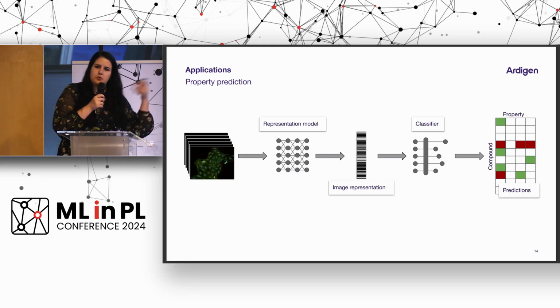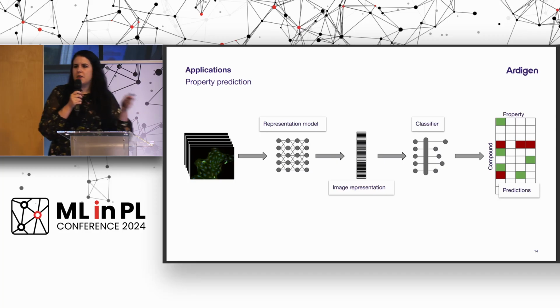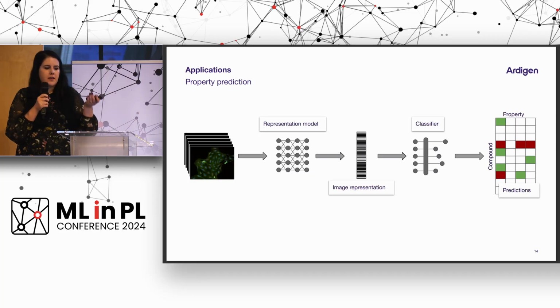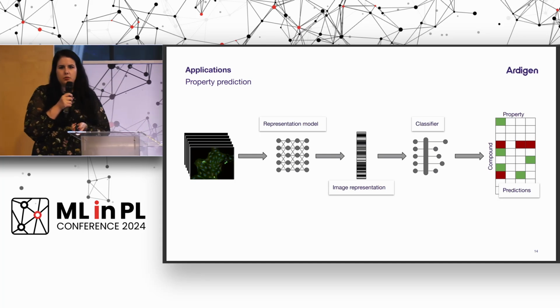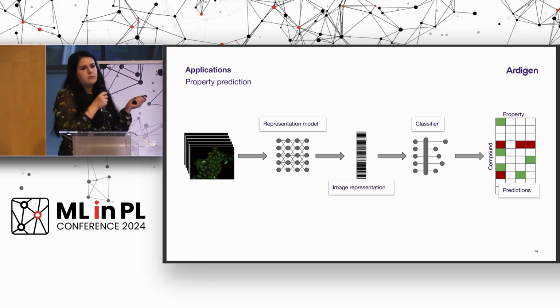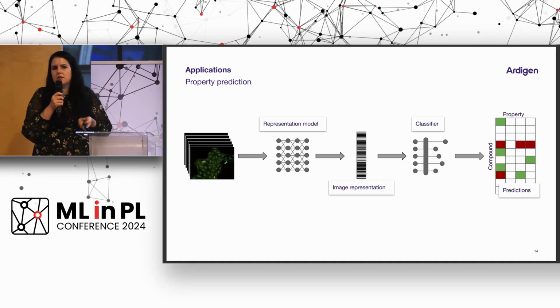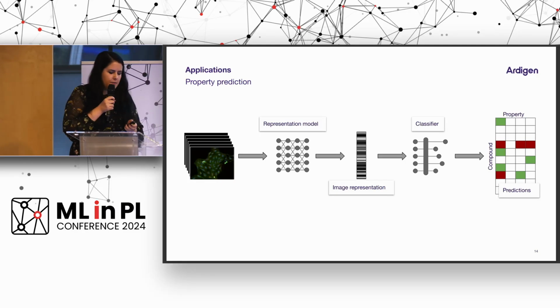However, end-to-end training also has its problems, in this case that we are very much limited to the task that we were training on, and we cannot transfer that model anywhere else. So we can split it into two parts: representation model training, creating a representation that describes the cell as well as it can, and then classifying that.